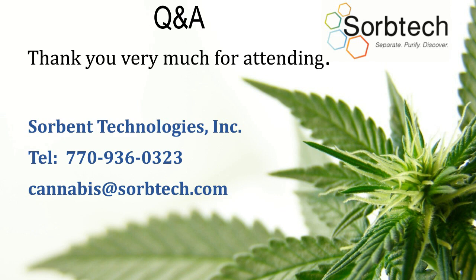So one of my tasks going forward, I'm already working on it, is to develop an SPE cartridge that is easier to use and gets rid of all the contaminants and leaves only the pesticides. So we'll eliminate the matrix effects. That's very commonly what analysts say: "Oh, I understand it's different." Well, that's the matrix effect, as if saying that means something. What we know is that it ain't right. So since they're not fixing it, we're going to help them fix it.